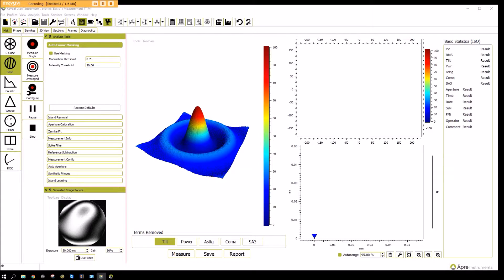Here is an example of how Reveal appears when first opened. Shown is the main measurement window, with the application profiles shown on the far left. Next to that are the measurement controls, the analysis tools following — which will be described in more detail later — and then the plots, and finally the basic statistics found on the far right side.